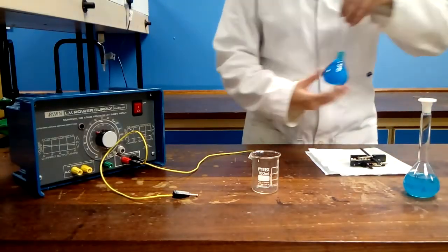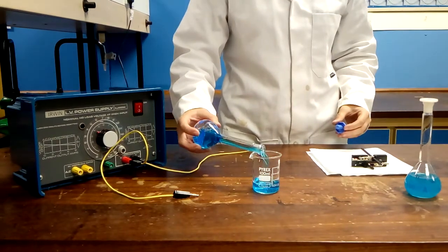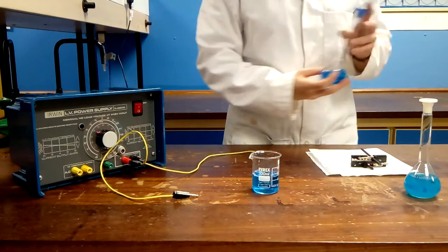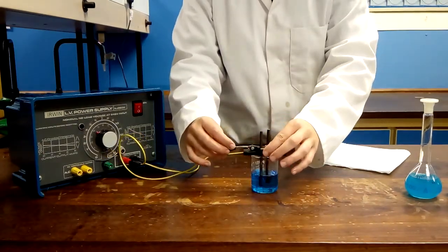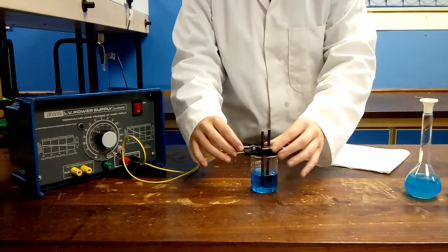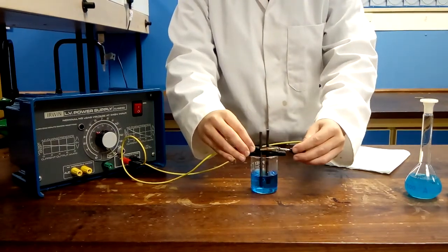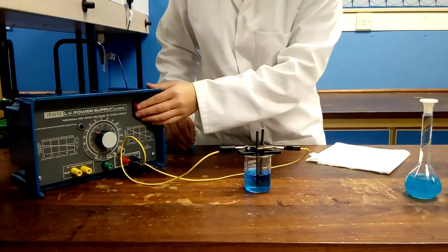Get your next salt solution ready, in this case, copper sulfate. Attach the electrodes to the power supply in the same way as before. Remember, the electrode connected to the black terminal will be the cathode, and the red terminal will be the anode.